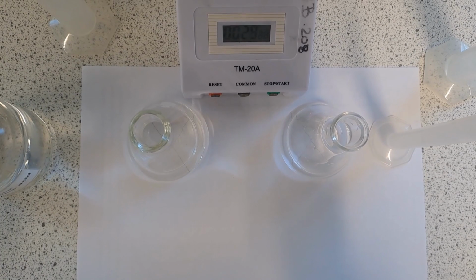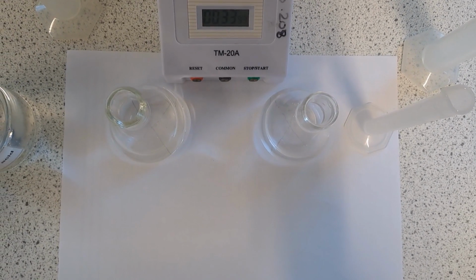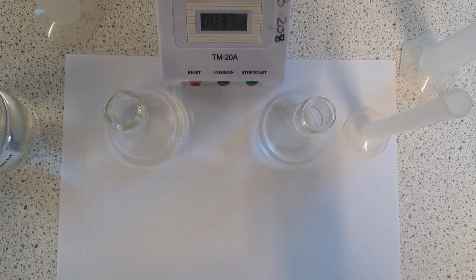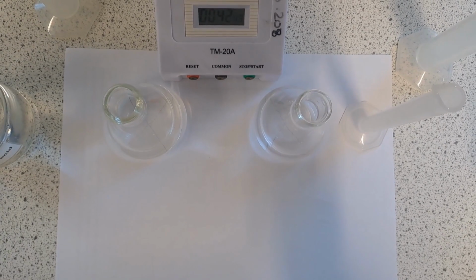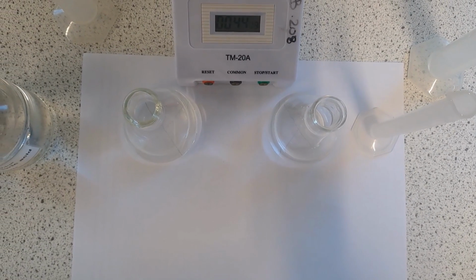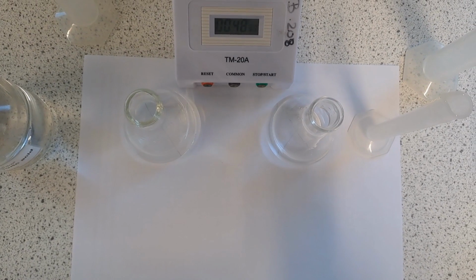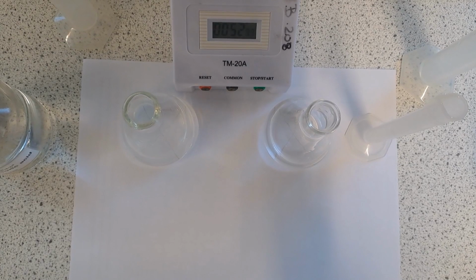Now, obviously, there's a bit of a problem with this, that this is all down to my human judgment and where I think I can't see it anymore, which is going to be affected by how good my eyes are. So a better way to run this experiment would actually be to use a light sensor that I could put underneath the conical flask, and I could see in terms of numbers when is less light getting through, and judge the end of the reaction that way.